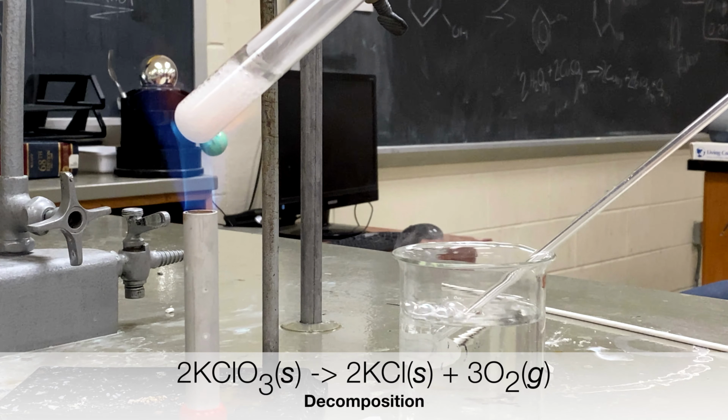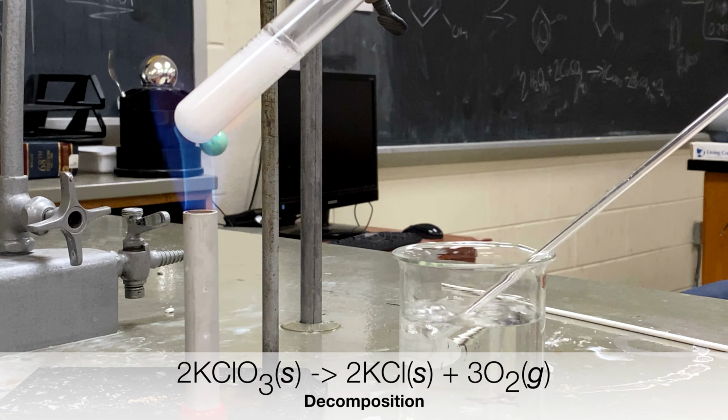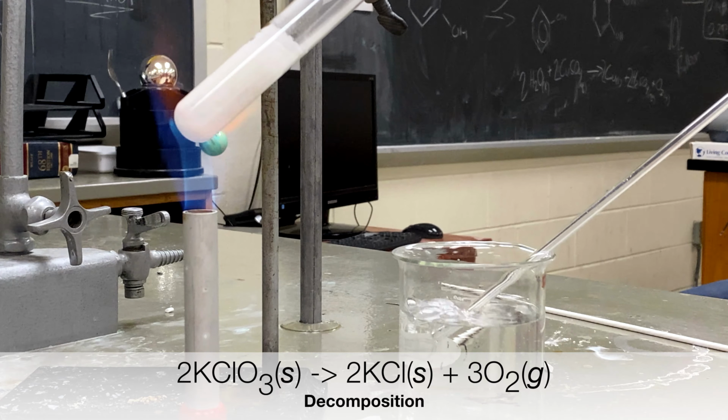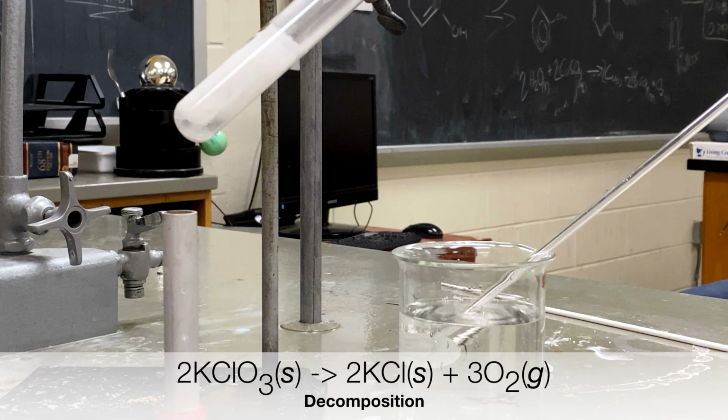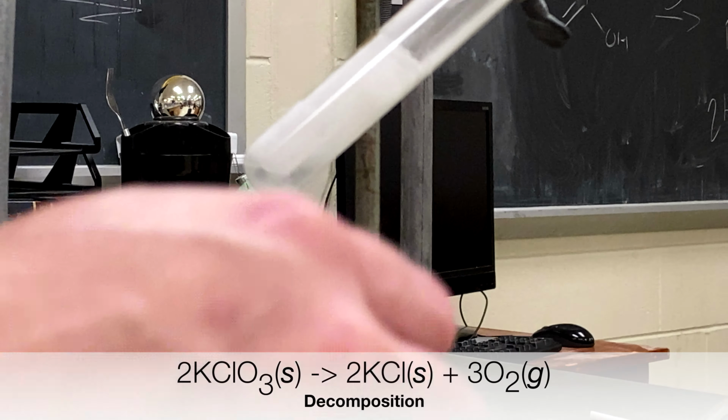This process will continue to produce the products until all of the potassium chlorate has been decomposed, and all we're left with is solid potassium chloride in the test tube, and all the oxygen gas has dissipated. Now that all of the potassium chlorate is gone, we have just the residue of potassium chloride left.